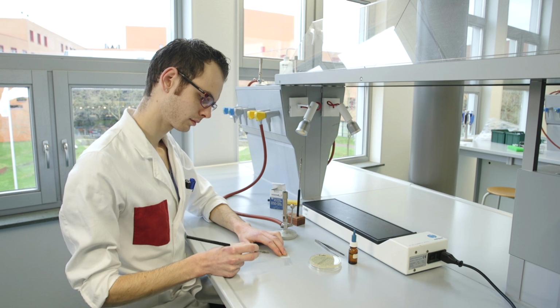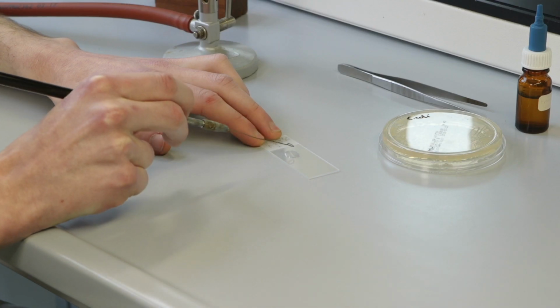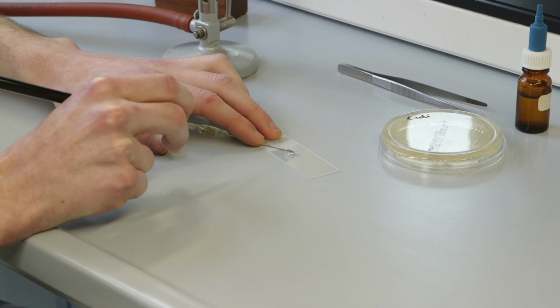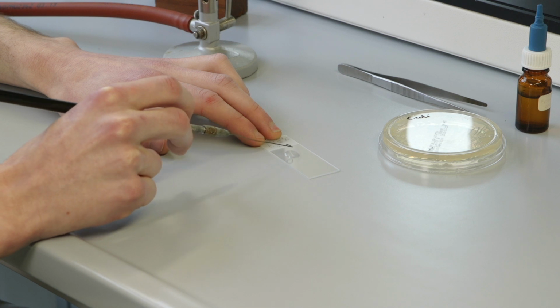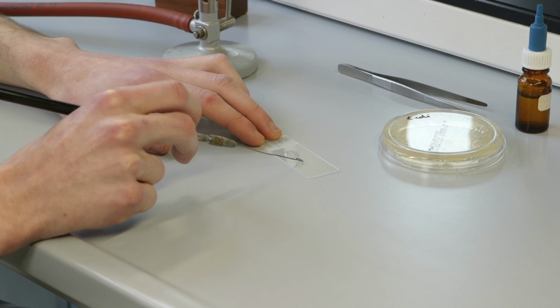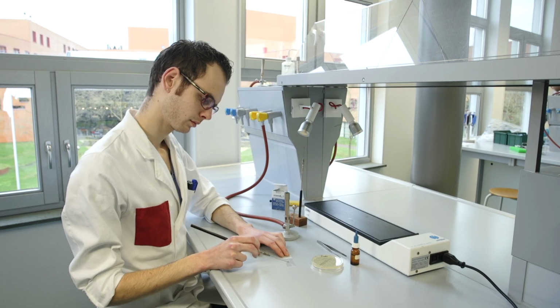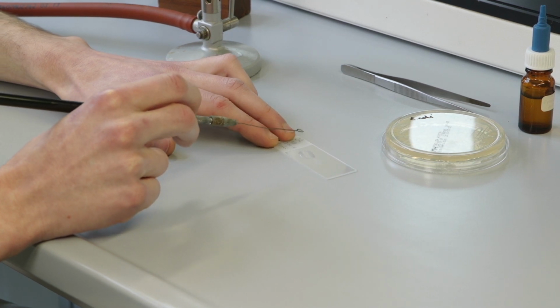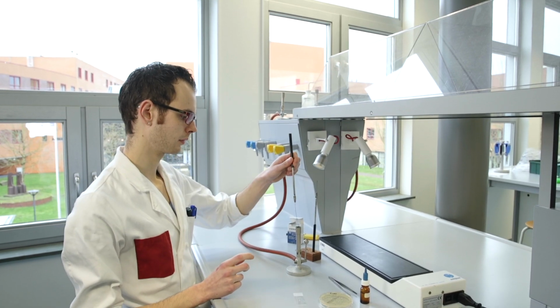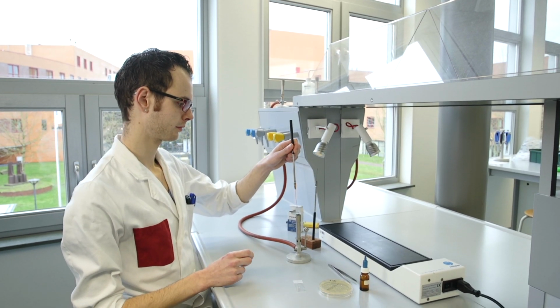Take a little saline from the droplet and mix it into the bacteria. To properly suspend the cells, you need to repeat this step about 3 times. When you have an even suspension, mix the rest of the saline so that there is both a concentrated and less concentrated part on the slide. To mix, bring the loop from the cells that have been spread on the slide into the saline and mix the suspension in the droplet. Flame sterilize the inoculation loop after use.